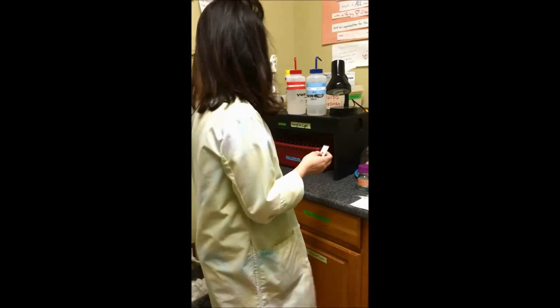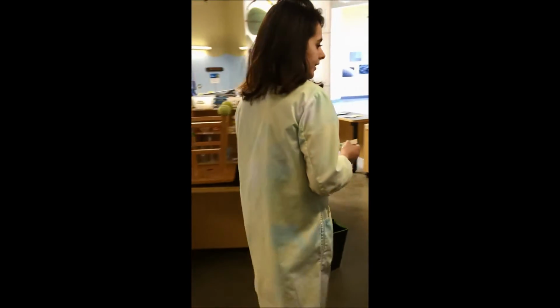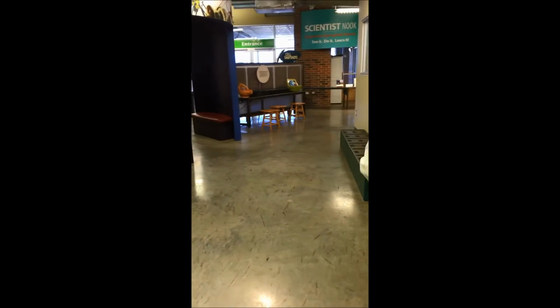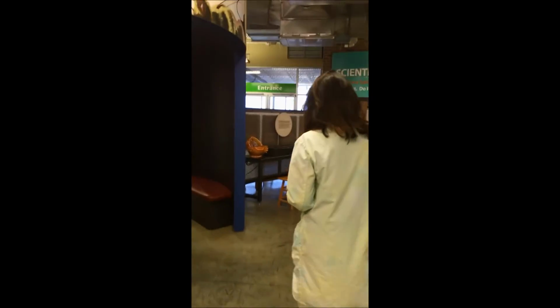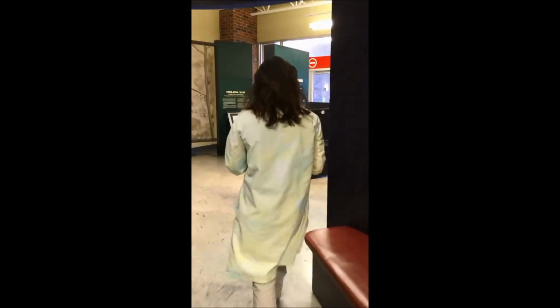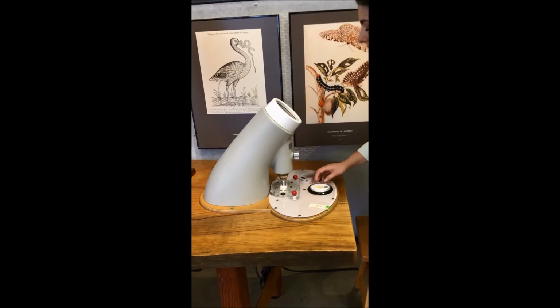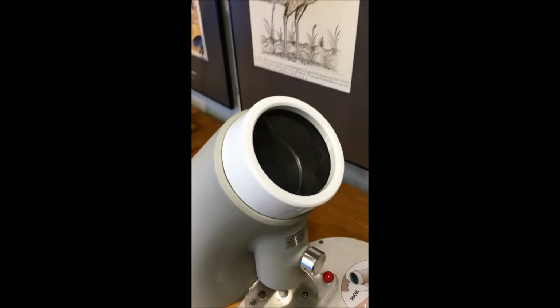Alright, and then to put it out in the gallery, we have a key that isn't working, so we have to slip the slide underneath the microscope. This is our microscope that we use for termites. And we have a button that lights it up. We have this big nozzle type of looking thing that... Oh, is this plugged in yet? Yeah, it's plugged in. Okay. It's just weird recently.